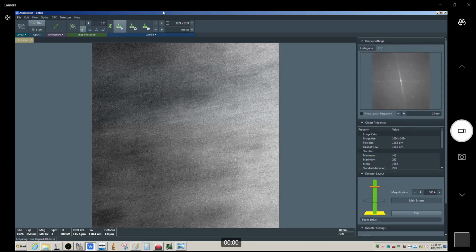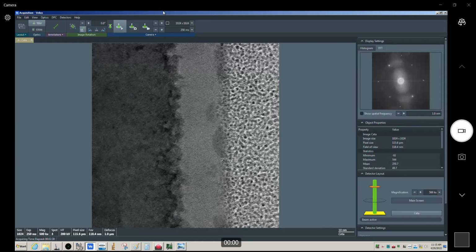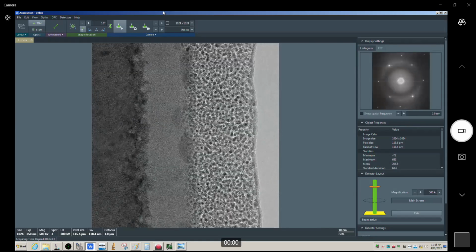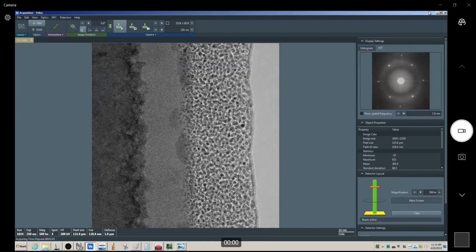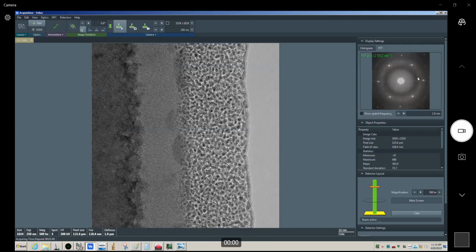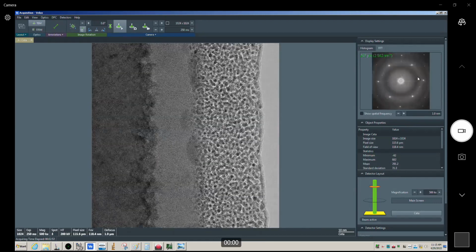There we go, we're getting close. Okay, so once you find something amorphous, you can make your correction here, and then just move back to where you were before. And now if you store the stage position, we already corrected it, and it looks good.